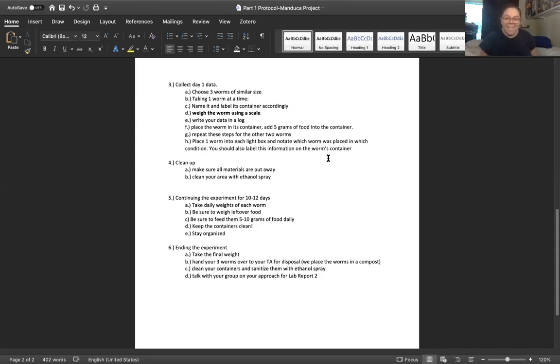But since we're actually doing an online class, I'm going to post my own log for you guys that you will use, since you guys aren't actually collecting your data, right? So you would take the first worm, you would weigh him, and you would write that 3 grams into your log.